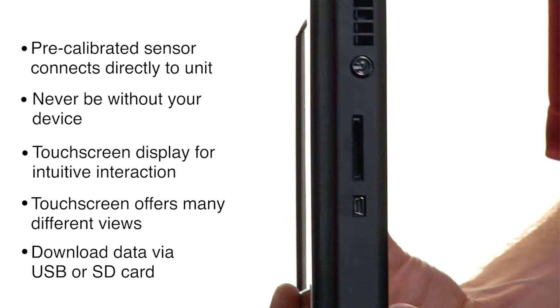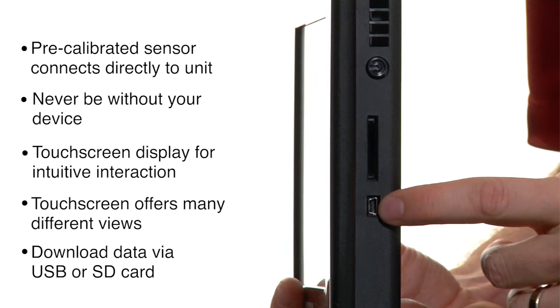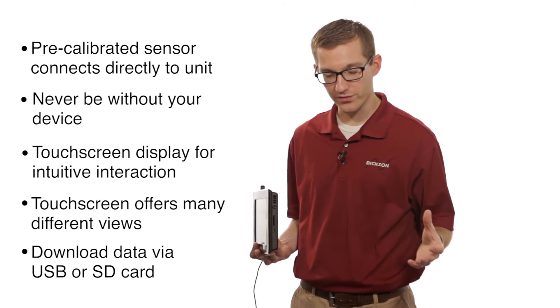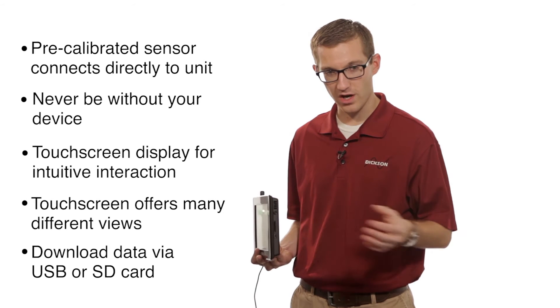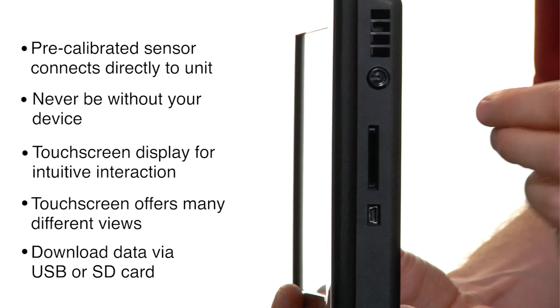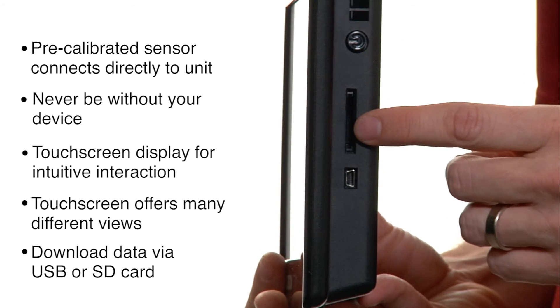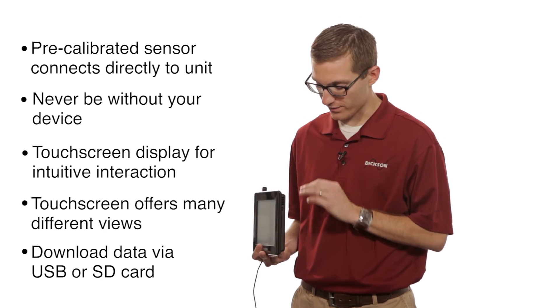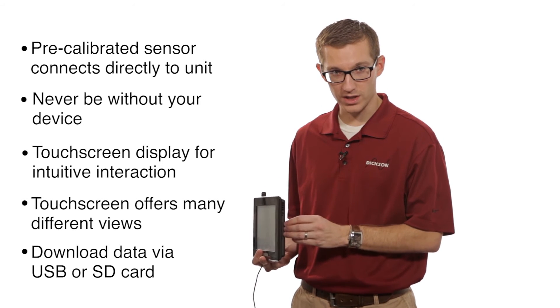There are two ways to download this unit. The first way is with a mini USB cable — just connect the unit to your computer, and you can transfer all the data from the instrument back to your computer. Or you can use an SD card like you would in a digital camera. You just slide that SD card right into the slot right here, hit menu download, and all that information transfers from the instrument to your SD card.